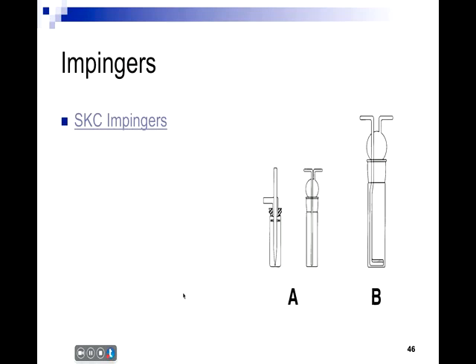And another method is impingers. These are liquid impingers, and you can get aerosol impingers as well. Impingers will work by bubbling dirty air through some kind of a solvent, and the solvent will collect the contaminants, and clean air will go out the other side of the impinger.